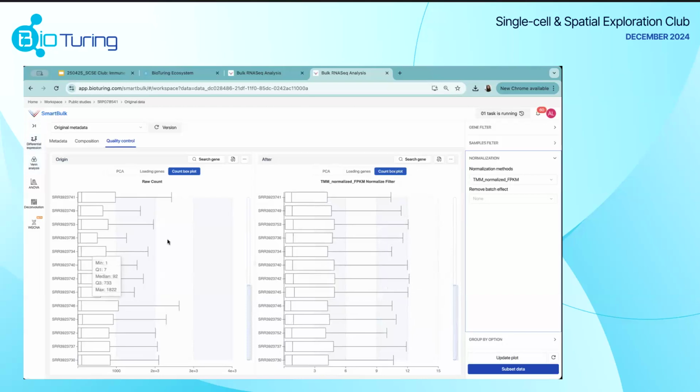Okay, so that's the first step that I wanted to make sure all users of the application are able to use, this specific pipeline workflow step, even on your own data, if you haven't performed any of these QC steps in the study. Okay, so from here, once we have the normalization, we want to make sure that you subset the data.